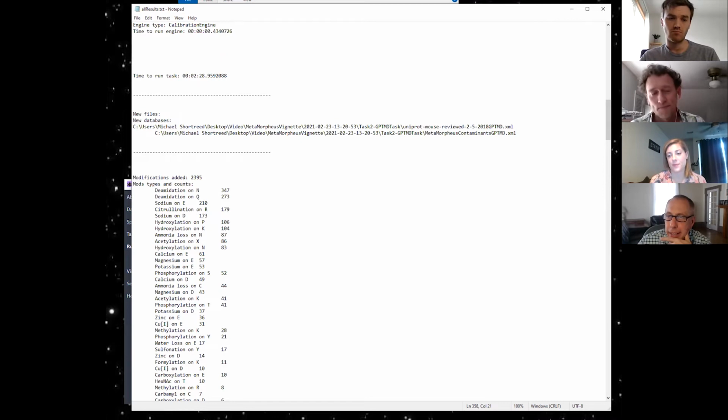So in the whole database, we added 347 deamidations on asparagine only. It's a really tiny number. If you had counted all the asparagines in the entire proteome of mouse, there would be thousands.